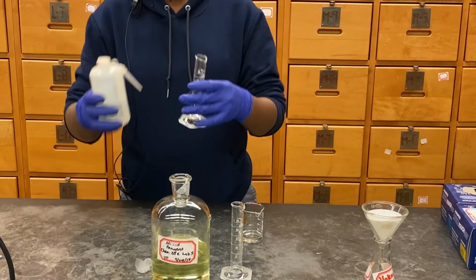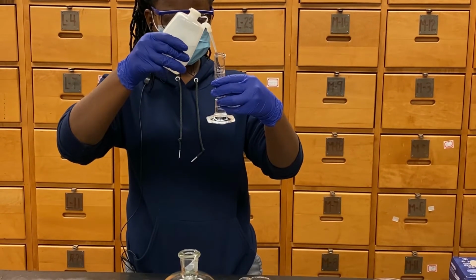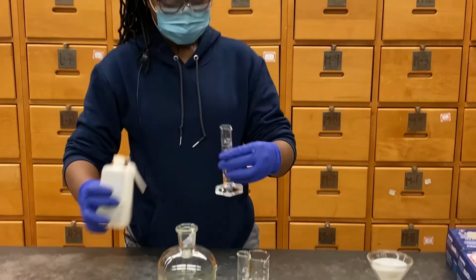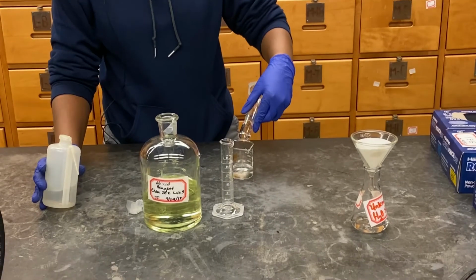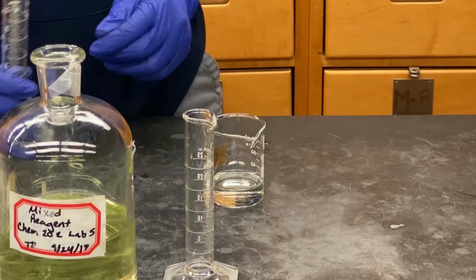And I'll use 15 mL of DI water. Then I'm going to allow this to sit for 15 minutes and we'll come back to check the absorbance.